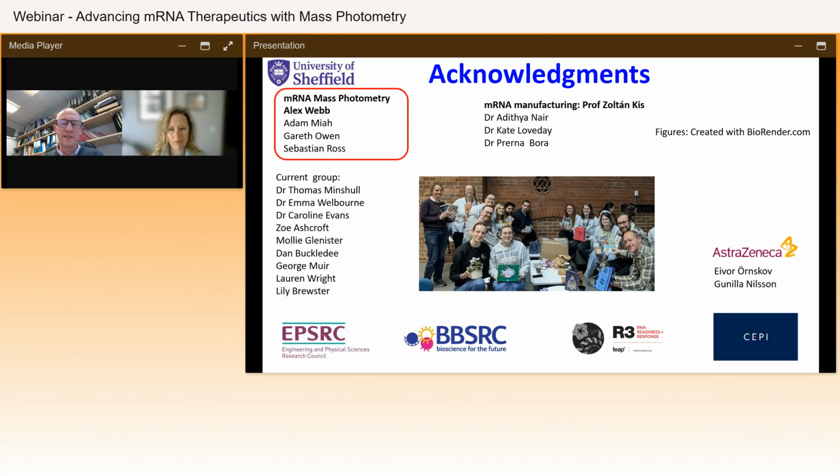I would say there's a caveat that it probably depends a little bit on your expertise and experience with in-house polylysine slides. In the early days, we were getting a bit of variability ourselves in how we generated these, but once we optimized those, we've got more consistent performance using our own in-house polylysine slides.